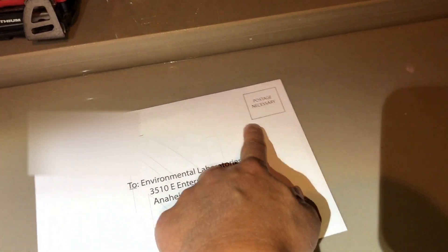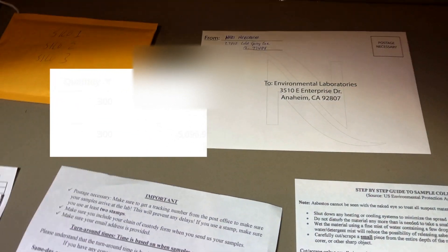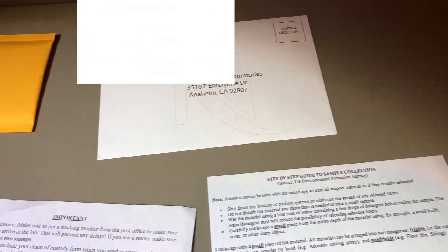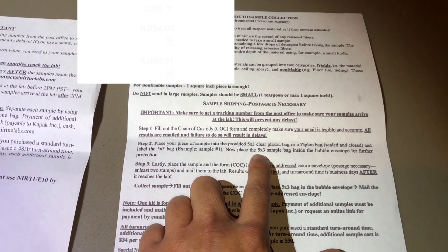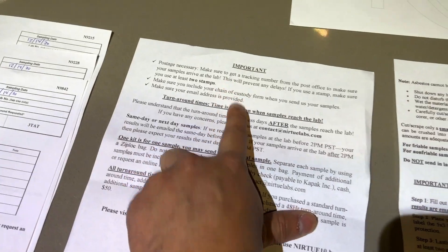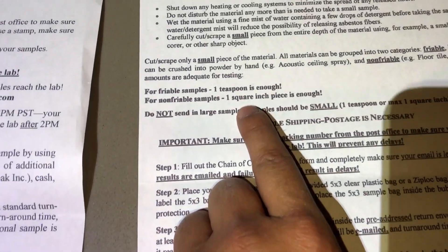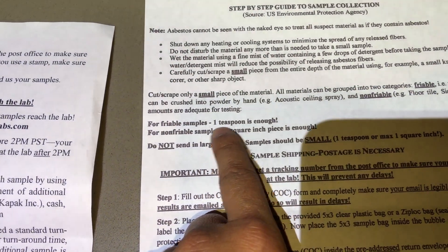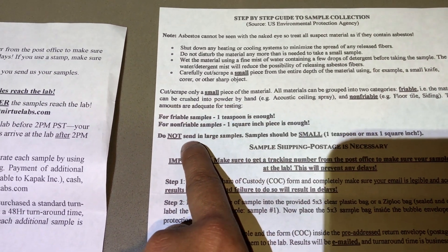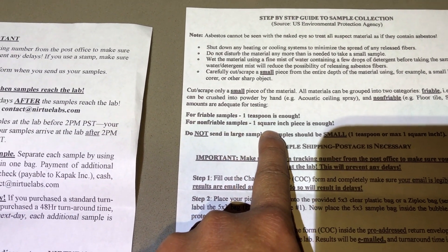I'm going to put the padded envelope and all the chain of custody forms inside the return envelope to send back. Note that you do have to add your own postage, and I'd recommend using UPS tracking, FedEx ground, or certified mail. Each kit also comes with step-by-step instructions and an important disclaimer.